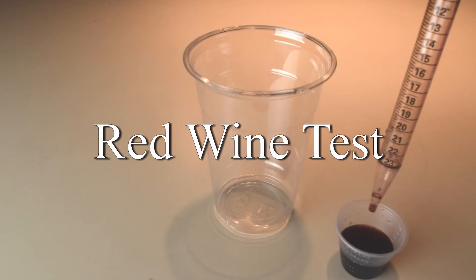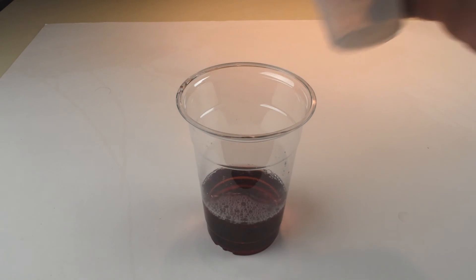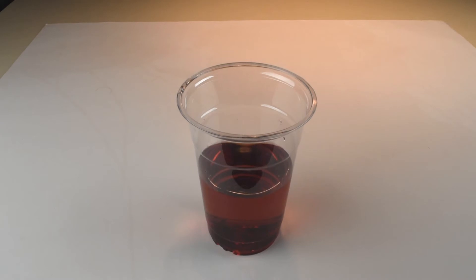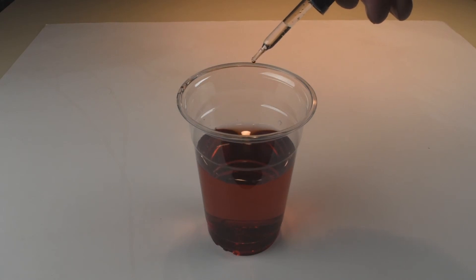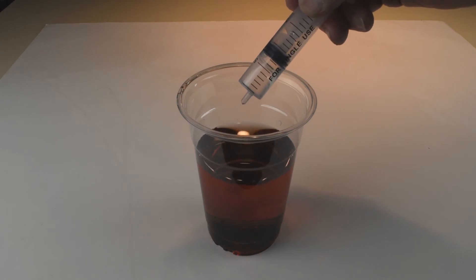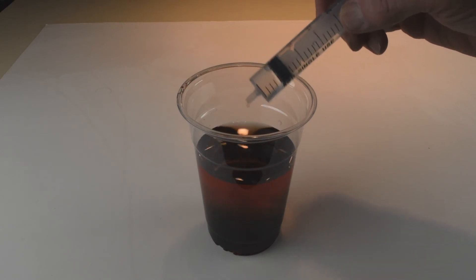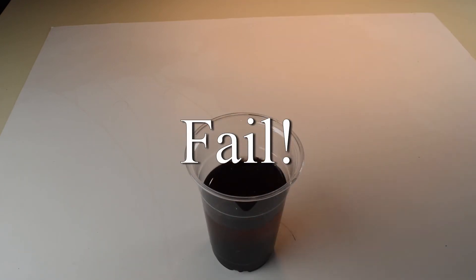For the red wine, I drew the same 15 milliliter sample but transferred it to a larger cup. I knew I would need to dilute the sample with distilled water to see the color change. I added 250 milliliters of water, then mixed in three drops of phenolphthalein solution and slowly started to add the sodium hydroxide solution. I ended up adding the entire 10 milliliters of sodium hydroxide solution without seeing a color change — the wine color was still too dark.